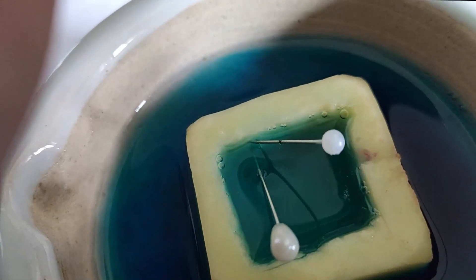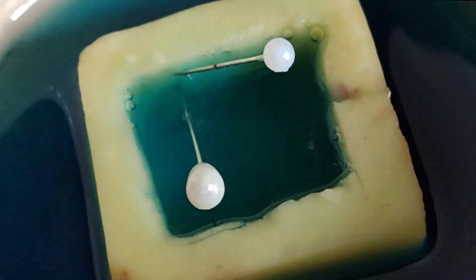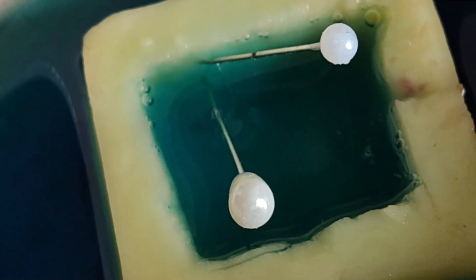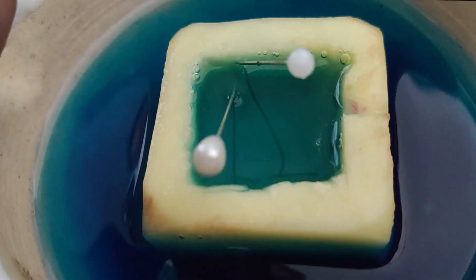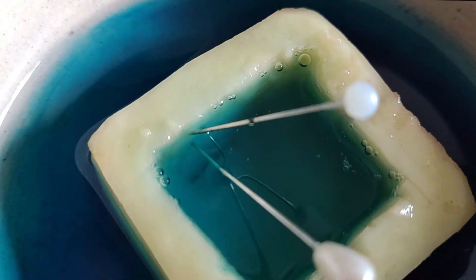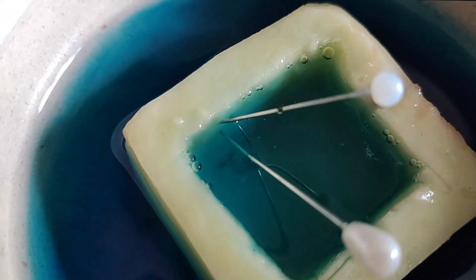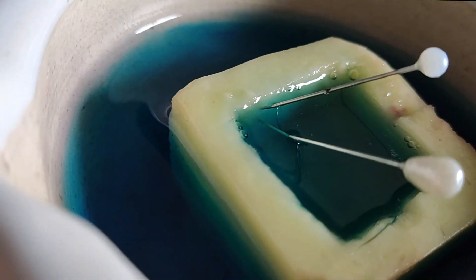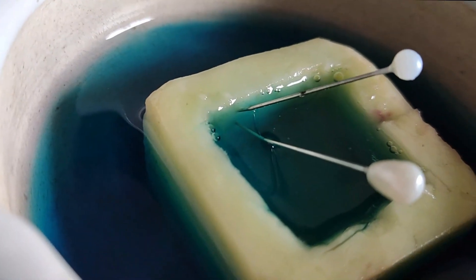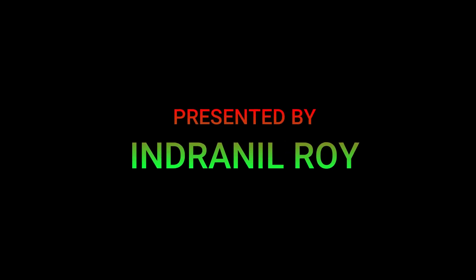The addition of the blue color helped us depict a clear picture of osmosis — the movement of water molecules from lower concentration to higher concentration through a semi-permeable membrane. We can clearly see the difference in water levels and the change of color, making the concept of osmosis using a potato osmometer very clear.